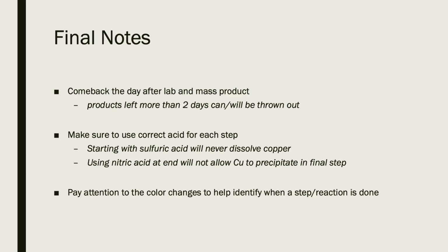And then the last thing, like I've tried to highlight, I think hopefully most of the way through these different reaction series here, just pay attention to the color changes, and that's usually the easiest way to identify when each reaction step is done. And that's the main thing we're going to usually look for in all of these.